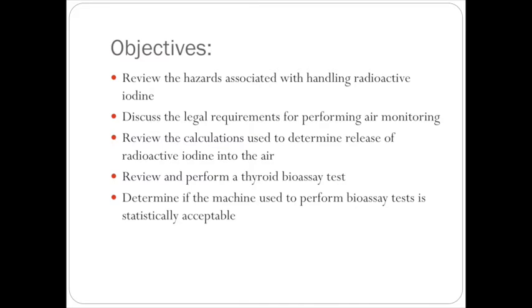The last part of this is going to talk about performing a thyroid bioassay. We'll talk about bioassay, what it is, and then we'll go over this step by step, because when you actually come to lab, this is what you will be doing. Setting up a machine and going through the whole process of counting your thyroid gland to determine if you have any radioactive iodine in your gland, and as you can imagine, you probably will not, since we haven't worked with any radioactive iodine in lab to this point.